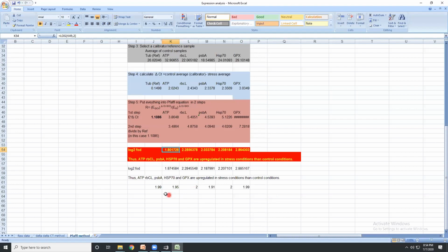In this particular example, even though most of them are varying from 91 to 99 or 91 to 100%, suppose it is not 1.99, let us try doing this. Instead of 1.99, let us make it 1.65.